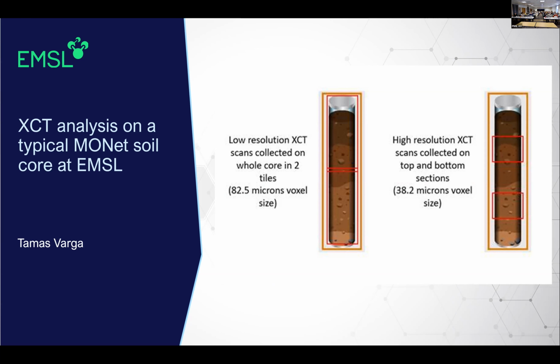So maybe you can do a dual energy scan and subtract data, or stain the organic matter if we are going after those. But on any CT tool, it's a challenge to distinguish the organic matter, for example in a wet soil sample. But it's a good goal, a good challenge.